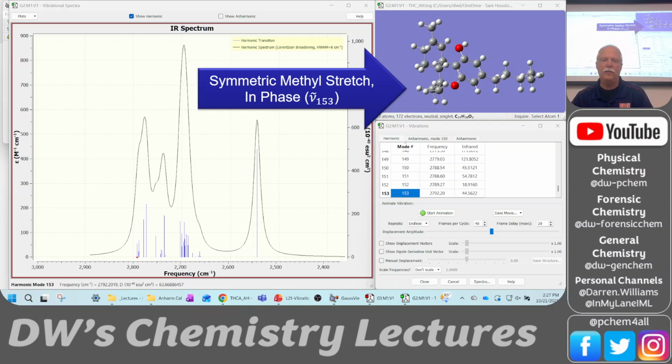And so here's the Gaussian calculation, and here's again for THC. You see, it's the symmetric methyl stretch, okay, but we have 2 of them. And so this is what I mean by in phase. We have 2 methyl groups. It's symmetric. There's nothing asymmetric about that stretch, but because there's 2 of them, they can be in phase. So that's what in phase is for.